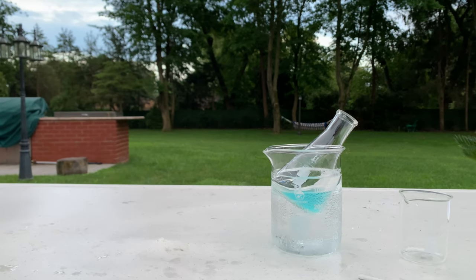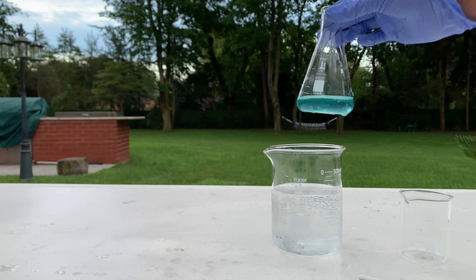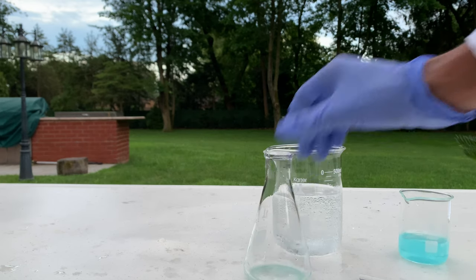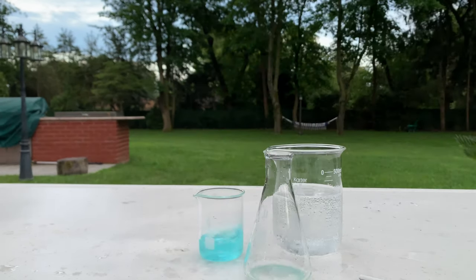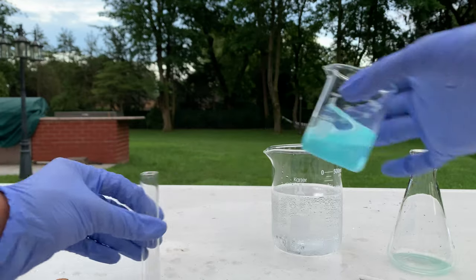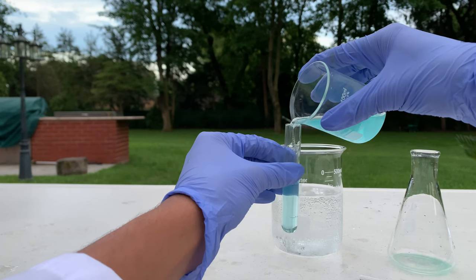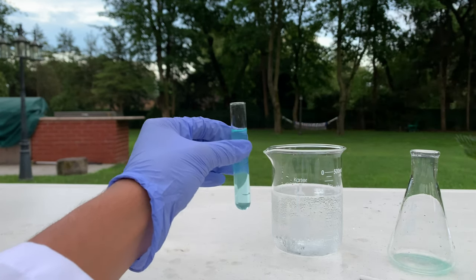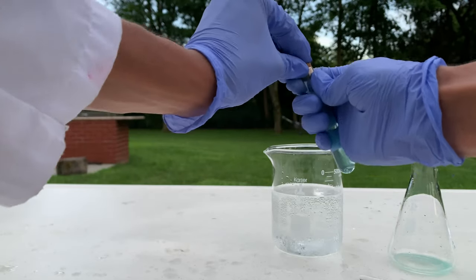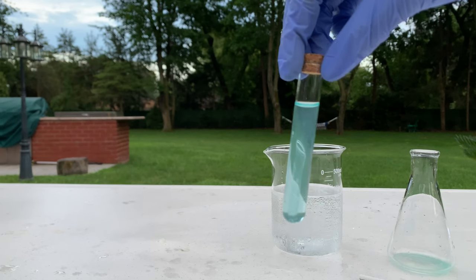It's starting to rain, so I've got to finish this up fast. I'm going to forget about crystallizing it and just store some in a test tube. I'm pouring some of it into this test tube — it's just going to be something nice to keep. It's okay that we didn't get the crystals, because this beautiful blue copper acetate solution is still really cool. And this is our final product: copper acetate.